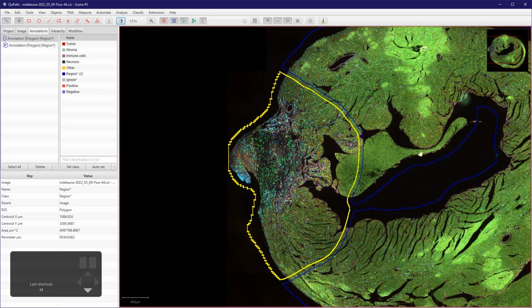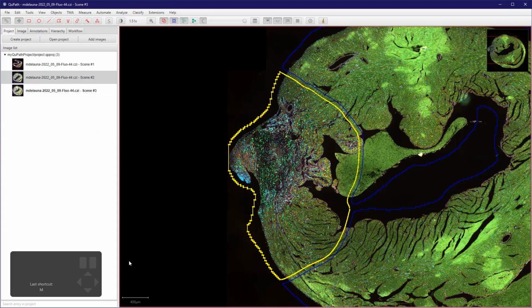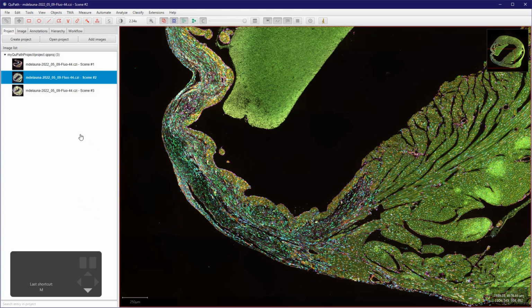So in order to do that, I will now switch to another image and do this properly. I could work from here, but I want to show you how you want to work properly with that. So here I will change this. I can save here for the moment. And what you want to do here is take one image, one copy of this image for each of the channels, and create a thresholder and create a classifier for each of the channels.